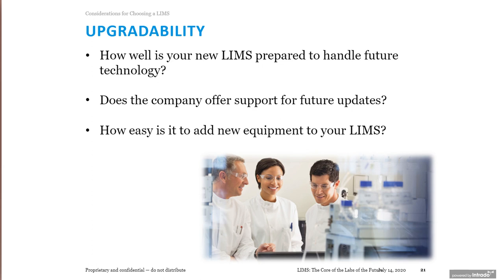Upgradability. How well is the new LIMS prepared to handle the future of technology? As I mentioned before, nowadays, every several months, we have changes in operating systems, database technologies, hot fixes. Can my system allow me the upgradability I need to cope with those technological changes? Does this company offer support for future updates? And how easy can I add new equipment to these LIMS systems without having to customize?